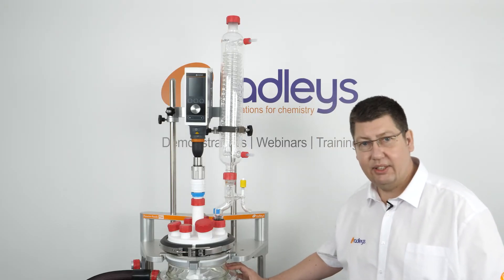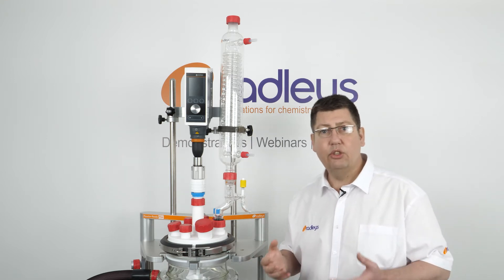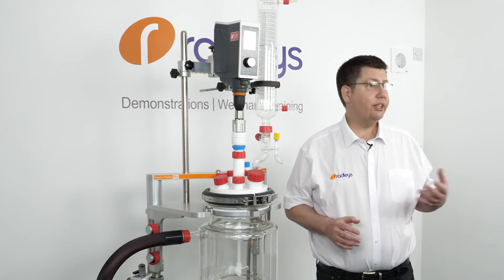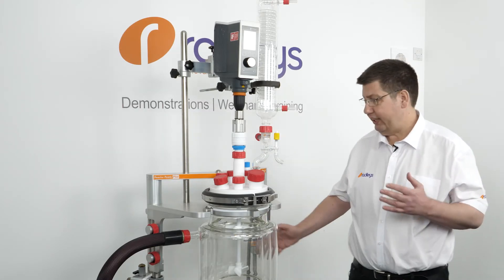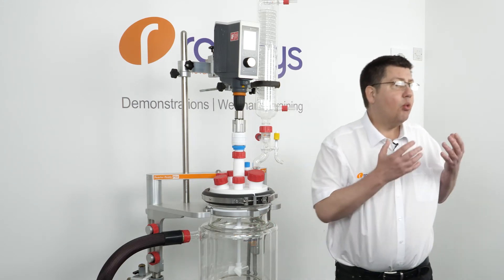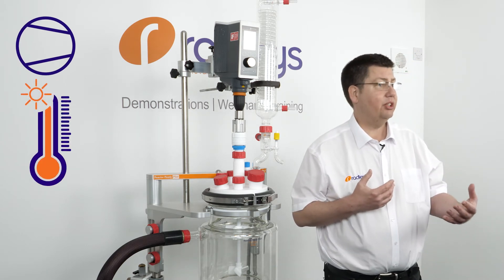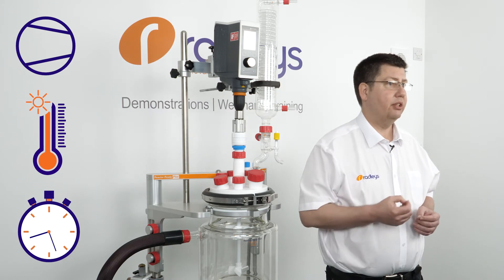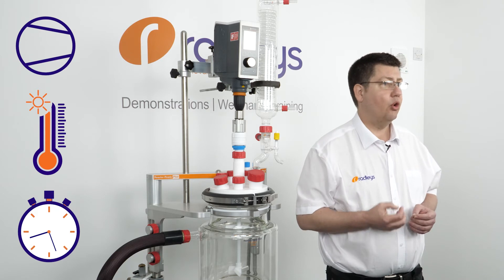Drying glassware like this in situ is generally accepted as the preferred way to eliminate moisture in the system prior to use. The techniques used are the same as when using a vacuum oven — we apply a gentle heat and a vacuum for a period of time. Exactly what level of vacuum and how much heat to apply, to what temperature, and for how long is defined by the chemist using an SOP — standard operating procedure — or by the lab supervisor.